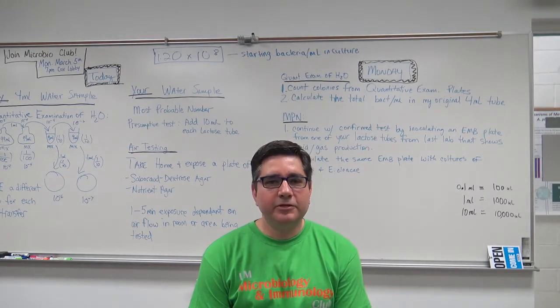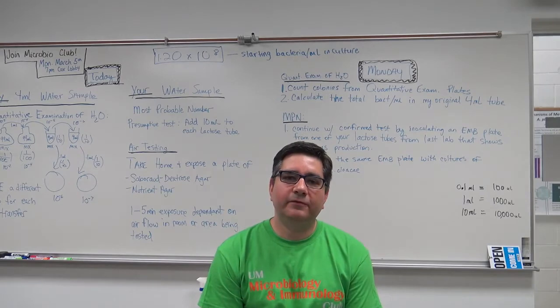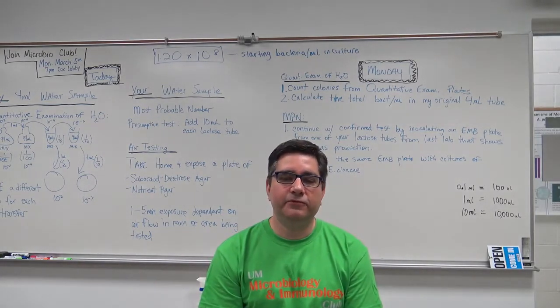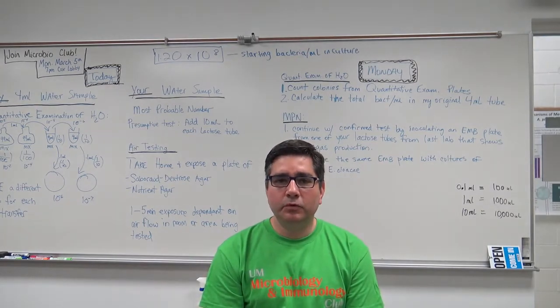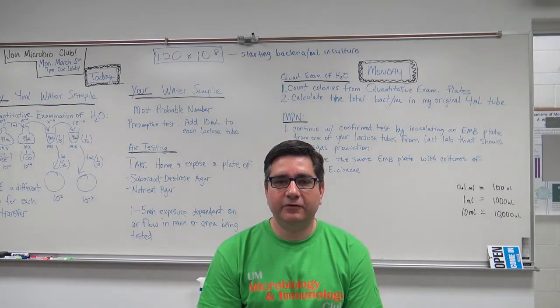During this procedure, make sure to use a different tip for each of the transfers, and once a transfer has been made, mix the container as well. In the case of the 99 ml dilution bottles, you will cap the bottle tight, shake the bottle, ensuring the organism has been distributed evenly throughout the solution in the bottle, and make the transfer into the next bottle or tube. In the case of the 9 ml water blanks, you will cap the tube securely, and using the vortex in the room, vortex the tube for a few seconds before making the next transfer.